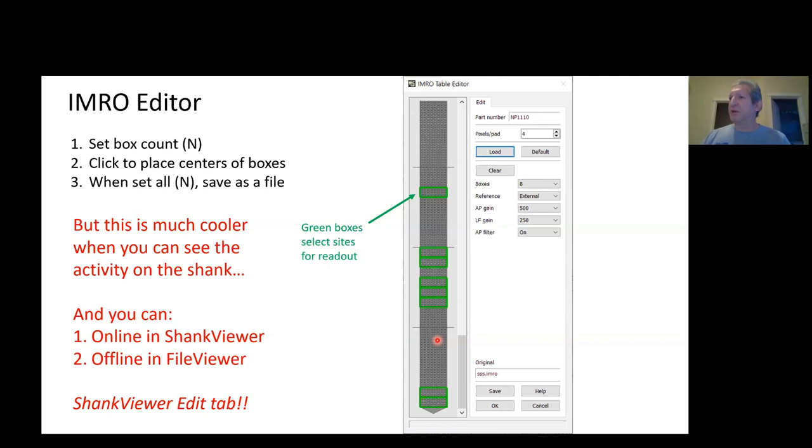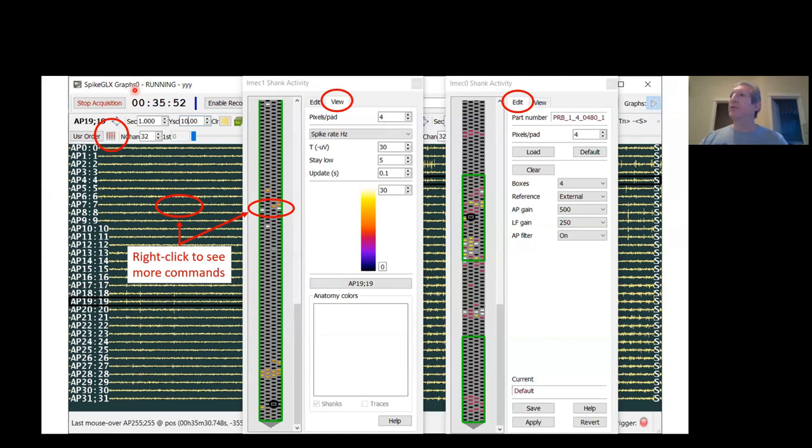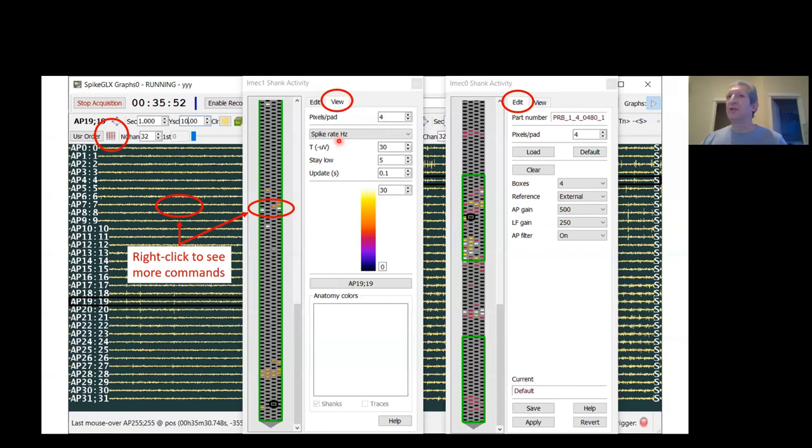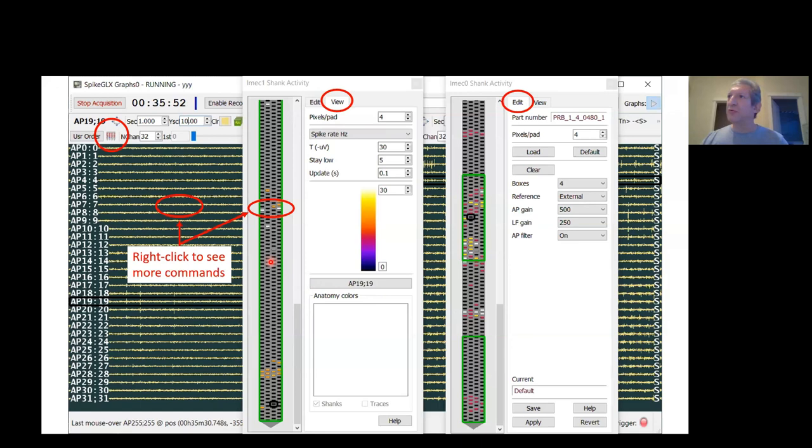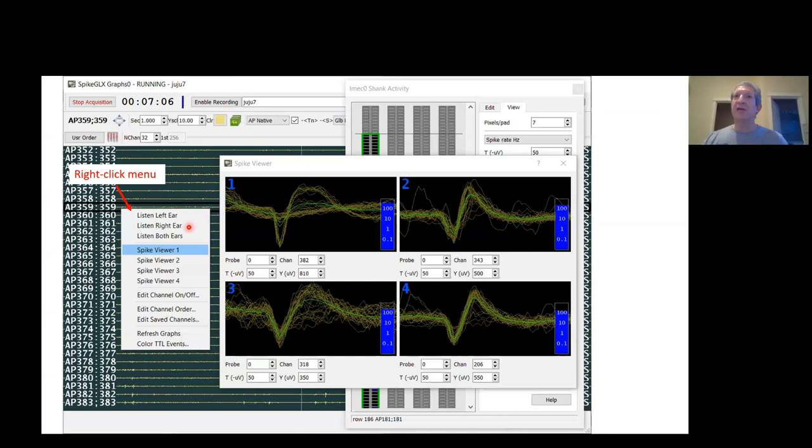Now this is much more useful if you can do this in conjunction with looking at activity on the probe so you know where to put your boxes. There are several ways to do this. One way is during a run. The graph window is going to open. Click on the shank viewer button here. That opens up the shank viewer with the view tab selected. You can use these tools to colorize activity on the shank, and then you can click on the edit tab of the viewer and you get the edit controls. Now you can put down your green selection boxes right over the activity of interest. While we're looking at this view, I want to point out that you can right-click on shanks or right-click on traces. That will pop up a menu of additional things you can do with the channel that you clicked on.